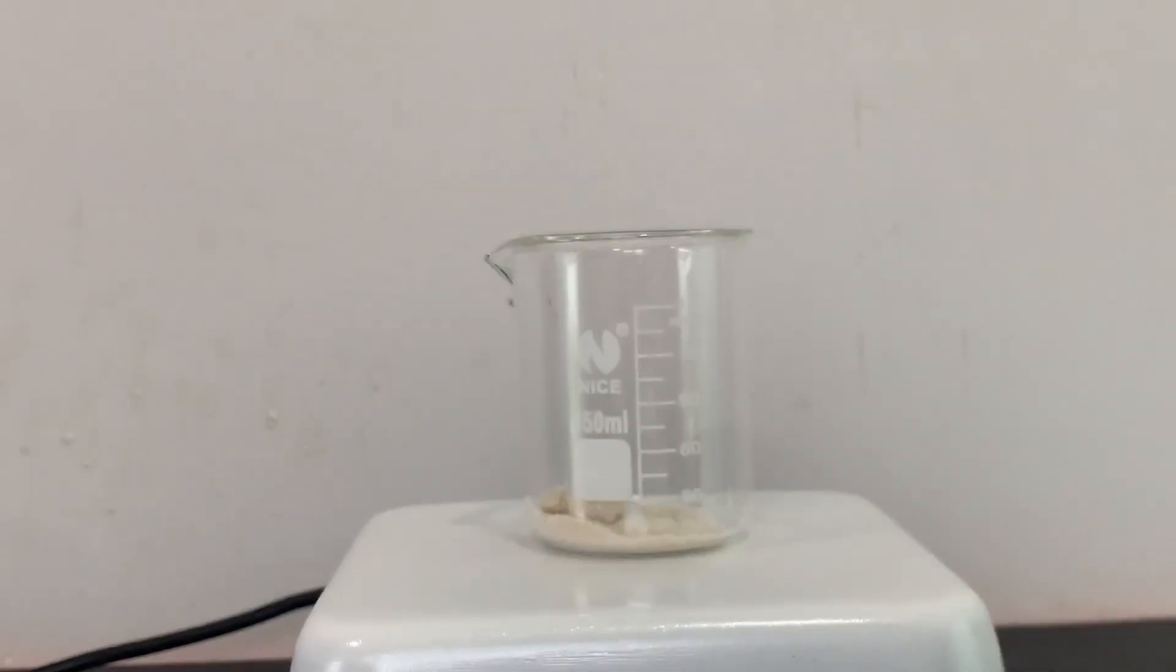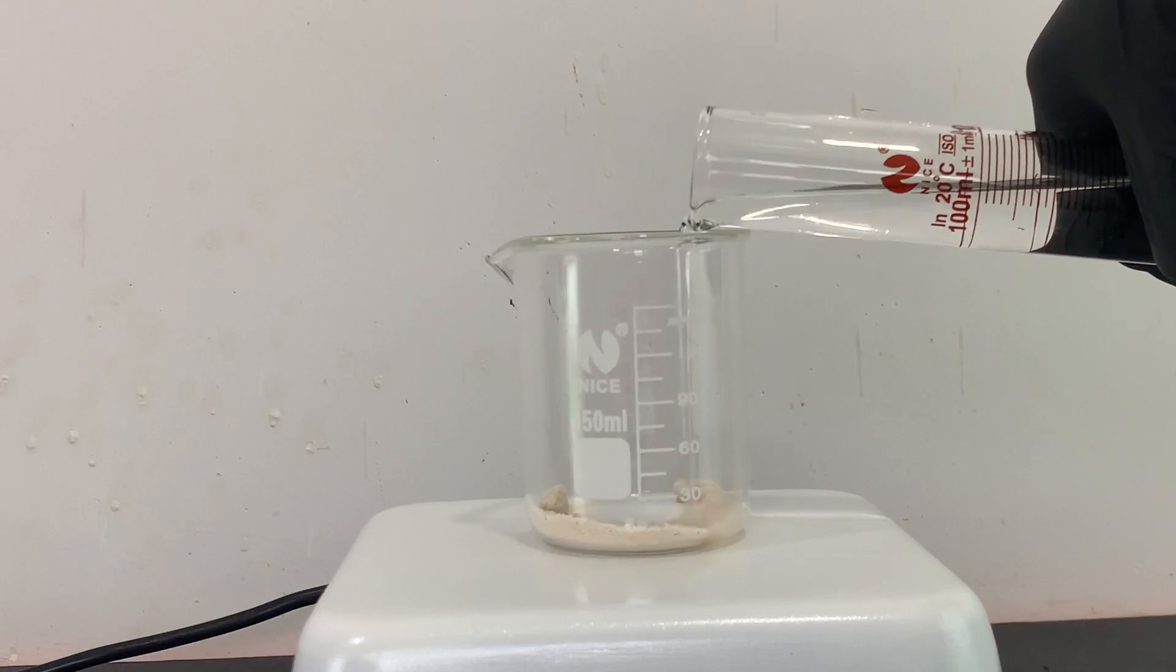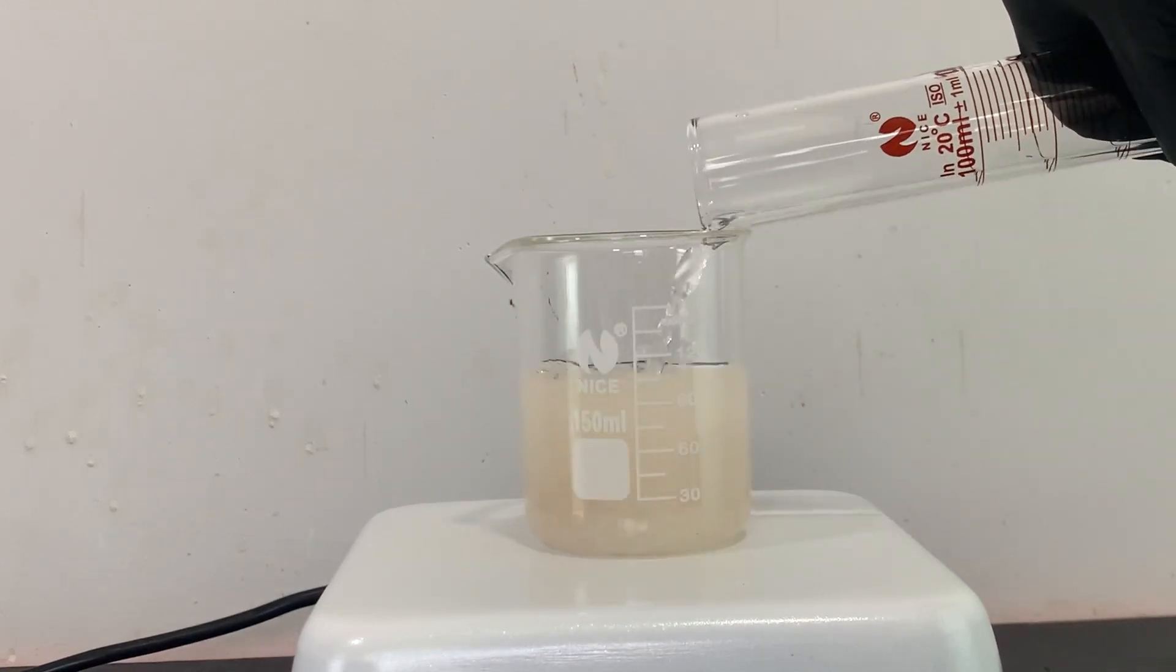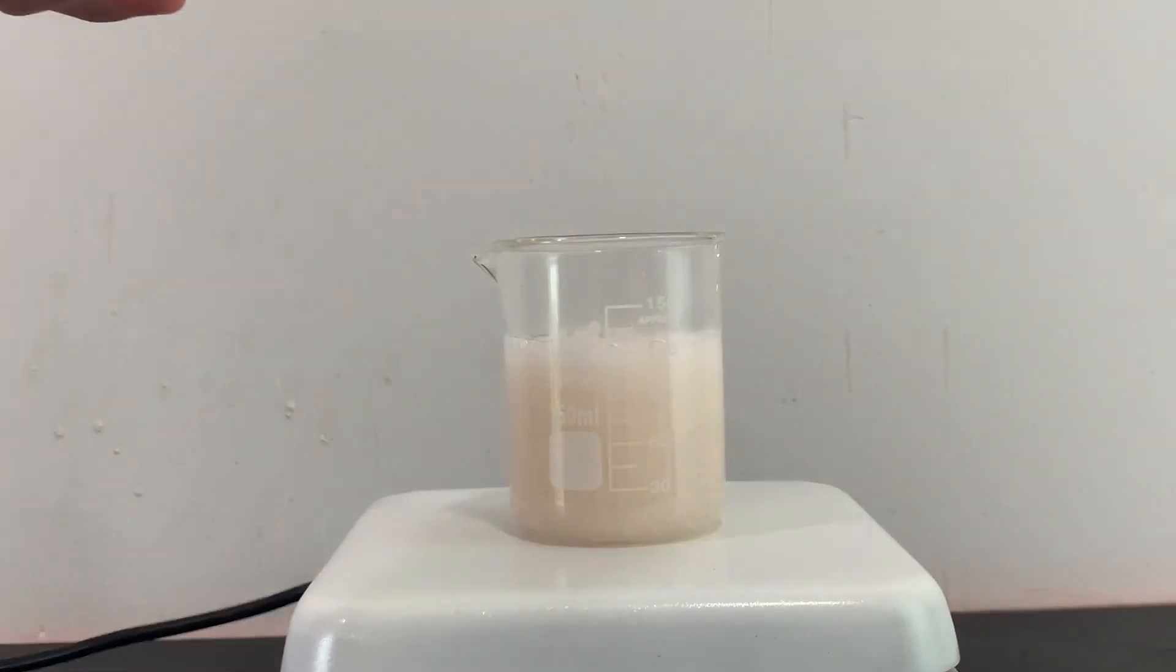I turned on the magnetic stirring and poured in 100 milliliters of water. I then slowly started adding 1.2 grams of sodium carbonate.